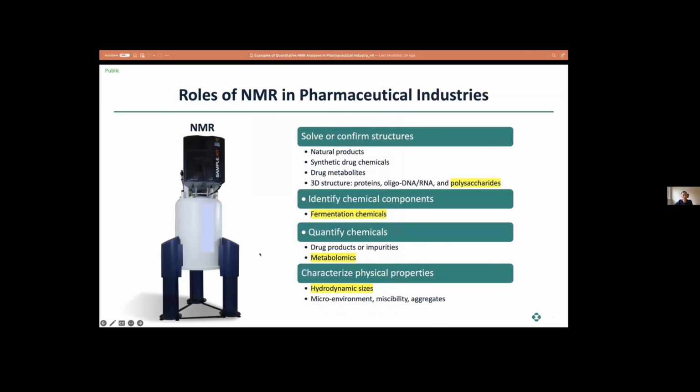So today my talk is about the role of NMR in the pharmaceutical industry, particularly in the case of Merck, where I support drug development and manufacturing. As you see from all the talks today, there are very sophisticated applications for biomolecules, but NMR is also unique for its quantitative nature and repeatability, and it is a very useful tool for solving lots of issues and investigations.